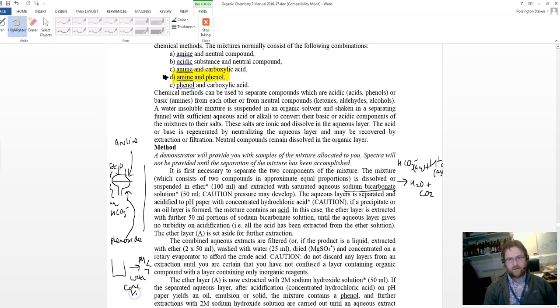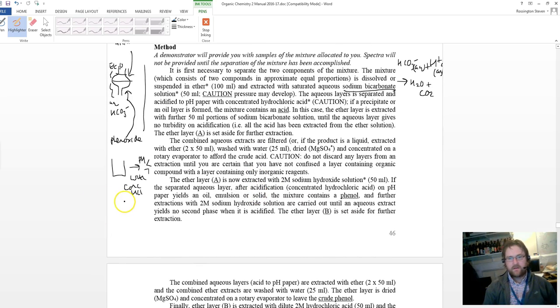with conc HCl, so you would have reacidified the solution, and then you would have put it back into the separating funnel. That's my separating funnel. You would have washed again with water. So the top layer now would have contained phenol, the bottom layer would have been water, so you would have washed it with maybe 2 lots of water, 20 ml, then wash with maybe a bit of brine, and this is the aqueous layer, so then you would have recovered a further fraction of the phenol.